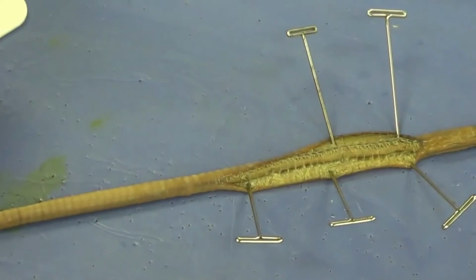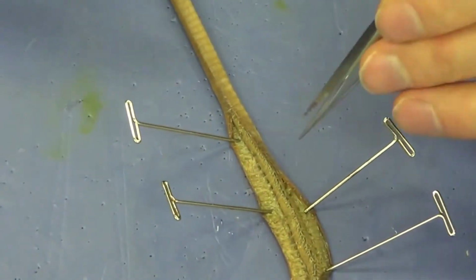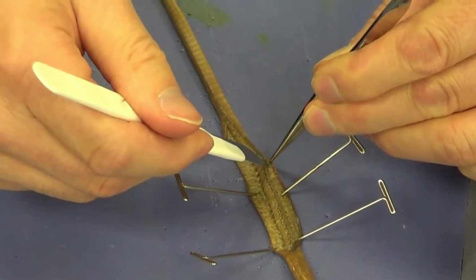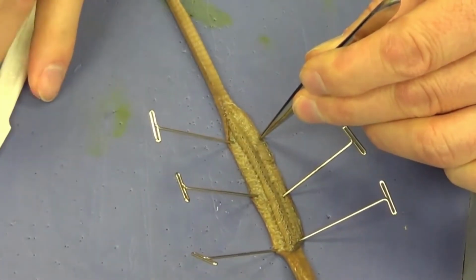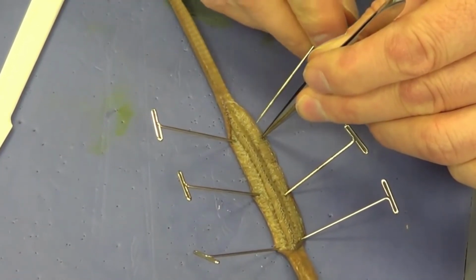Now as we do this, if you're working in a group of 2, make sure that only one pair of hands are in here at a time. So I'm going to go ahead and go down the other side here. And again, I just work my way down a 1/2 inch to 1 inch at a time.